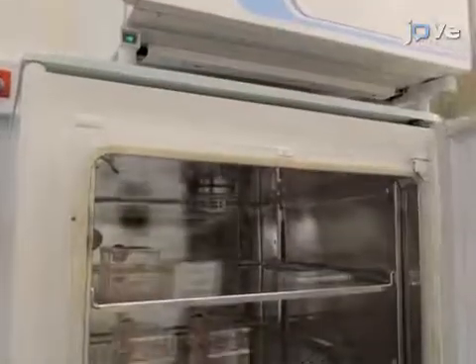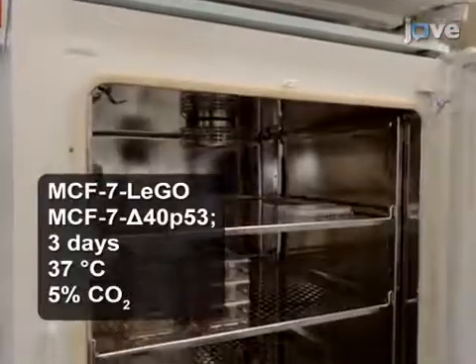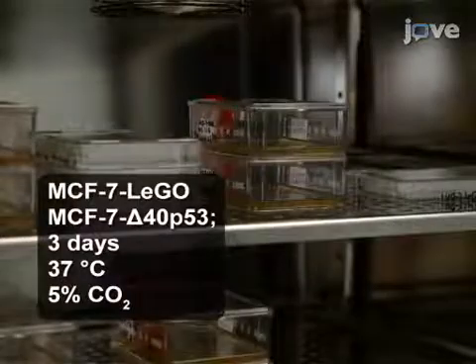To begin this procedure, grow two MCF7 cell lines for three days to 75-80% confluence in T75 square-centimeter tissue culture flasks using phenol-red-free DMEM.